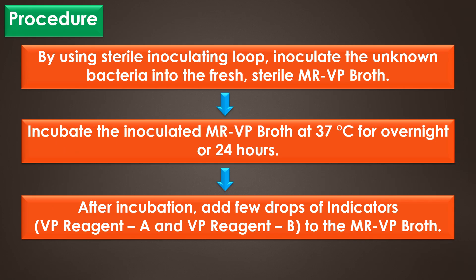By using a sterile inoculation loop, inoculate the unknown bacteria into fresh and sterile MR-VP broth. After inoculation, incubate the inoculated MR-VP broth at 37 degrees Celsius overnight or for 24 hours. After incubation, add a few drops of VP reagent A and VP reagent B to the MR-VP broth.